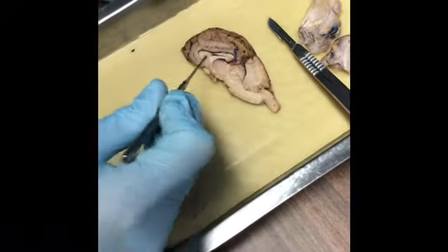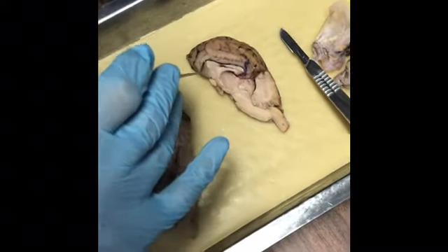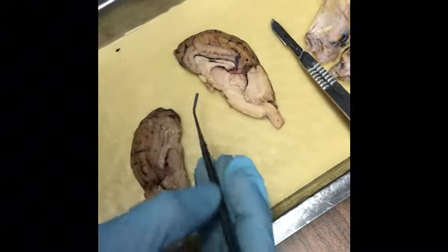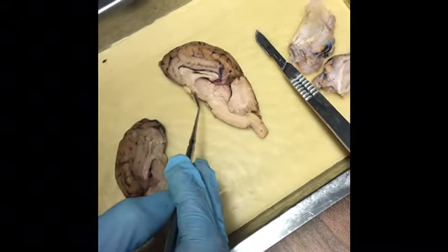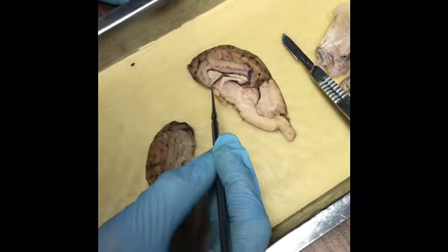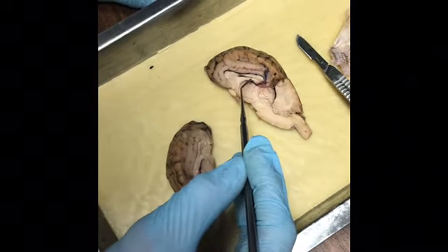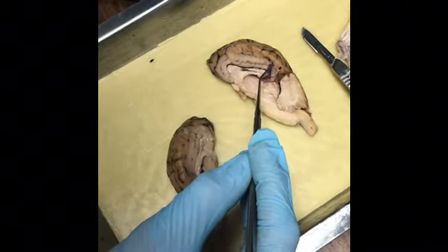So the next part is the mid-sagittal section. I'm going to go ahead and go down the list of things to identify here, and the first one is the corpus callosum, which is this area right in here, and then the thalamus, which is located here, and then the hypothalamus, which is located right below it. The lateral ventricle, which is this line that's right through here. And then you have the septum pellucidum, which would be this part that's right in here.